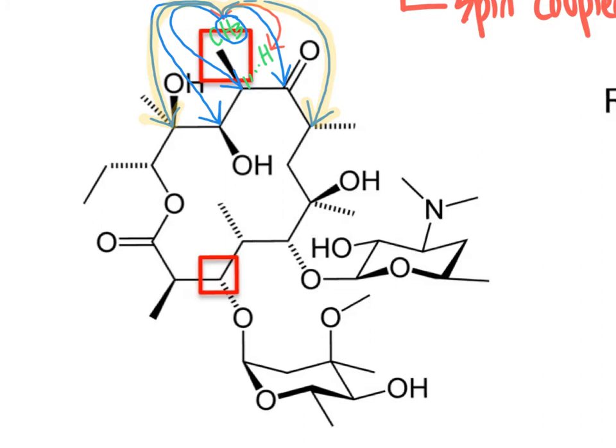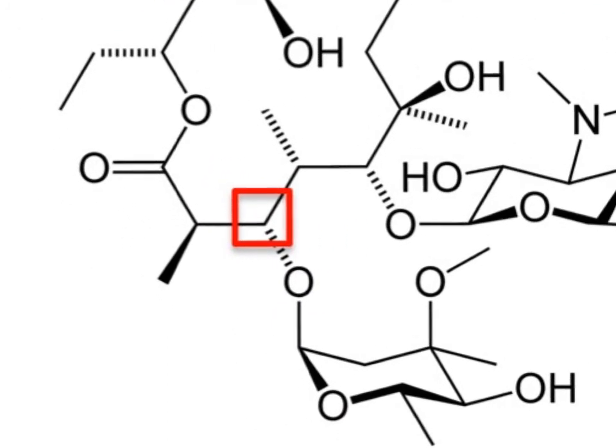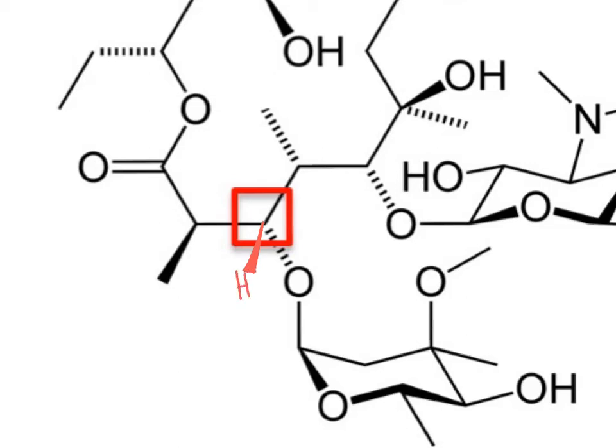So similarly, let's come down to here. And I will zoom in just a little bit there. And at this position, we would expect to have 1 proton. I can sketch that in explicitly. So there's our 1 proton.